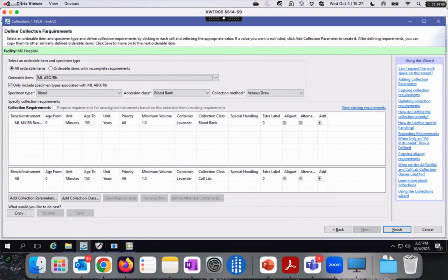I'm not going to bother re-adding my orders because it was a little thing, and it's not going to stop me from being able to continue on anyway. But it's little stuff like that. Yeah. Sorry, I did the exact same thing, and I recall when you marked it as blood and not blood bank, and I thought it was on purpose, so I followed. Okay, so I went into associated assay and its collection requirements. That's where I missed it. Okay, collection requirements, got it.